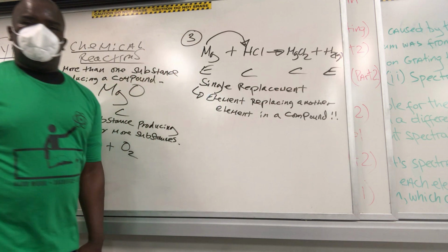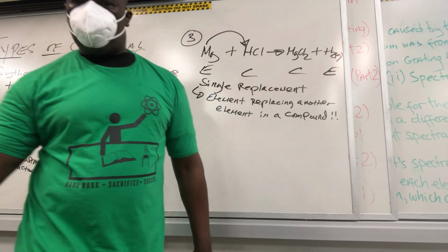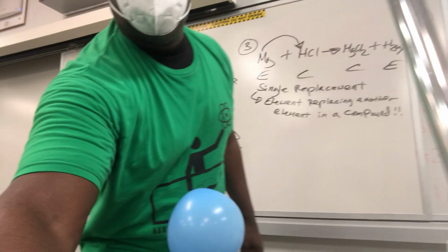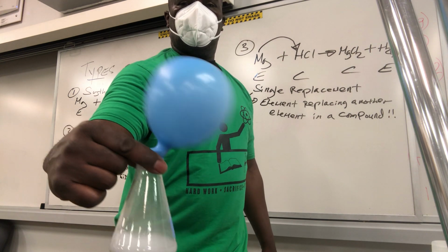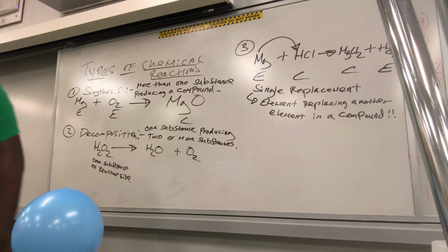That's called single replacement. All right, so let's do another reaction. Ooh, nice, very nice. Okay, so that's our single replacement right there.